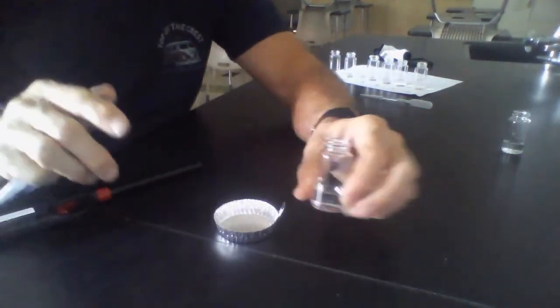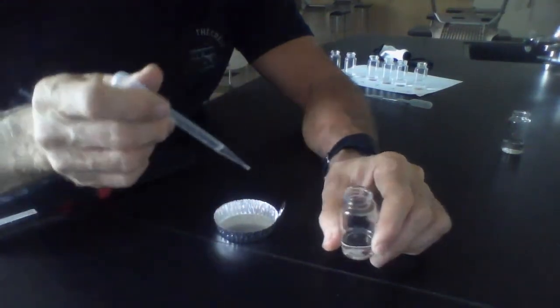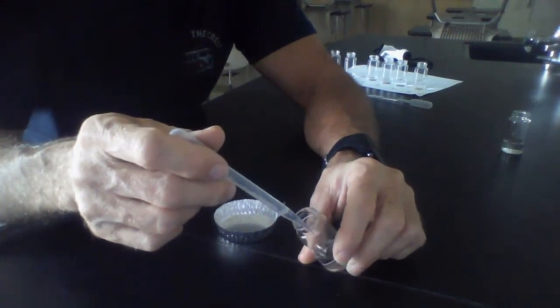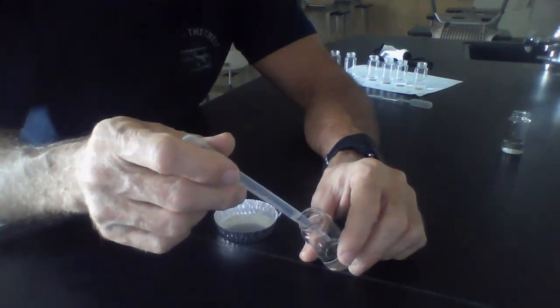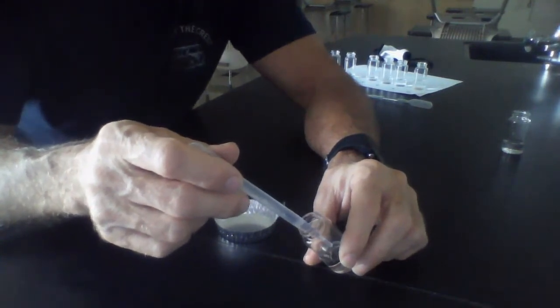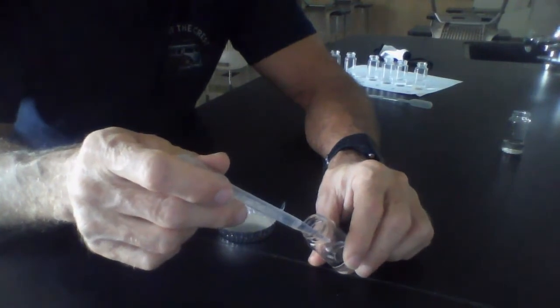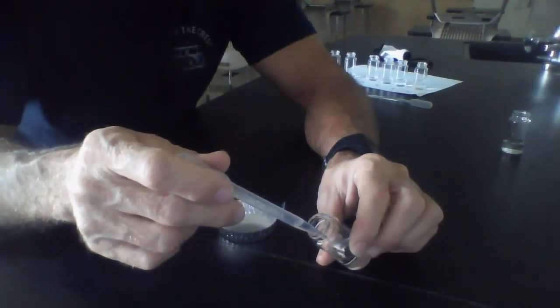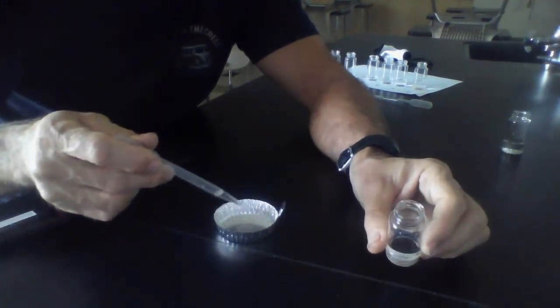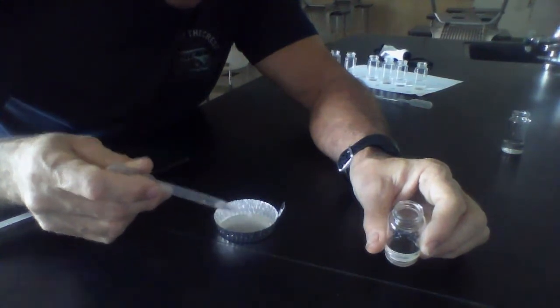Okay, now we have methanol, so I'm going to take 5 drops. I'm going to place it in here, and I know that some of these might evaporate quickly, so I'm going to put in the 5 drops, move everything far away, and as soon as I can, I'll get that igniter to it. And you may want to time the flame length. I'll make some descriptions as we go too, in case the video is not too clear. So here we go. 1, 2, 3, 4, and 5.